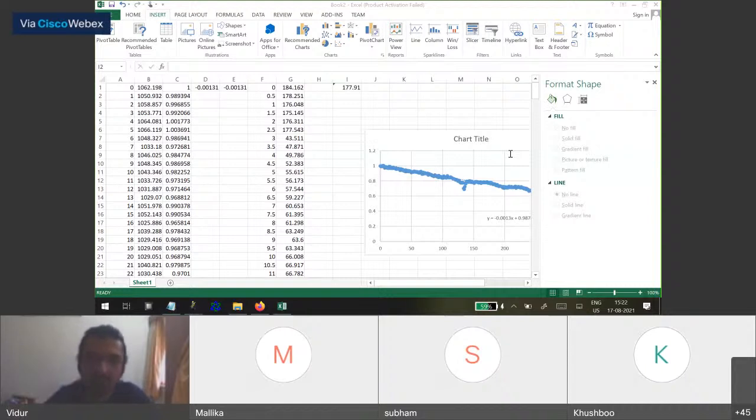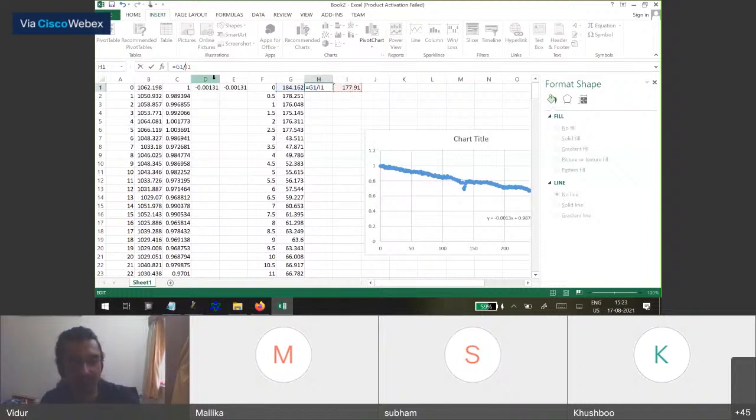Okay. So moving on to the analysis, you average out the first 6 values because it's imperative that we know where our intensities are starting from. The second thing to do is to put, again, equal to this, which is your intensity value, divided by your normalization value. And like previously, we will put a dollar sign before and after. So it should read as dollar, whatever letter, in this case I, $1. And you press enter. You'll have this intensity normalized again.